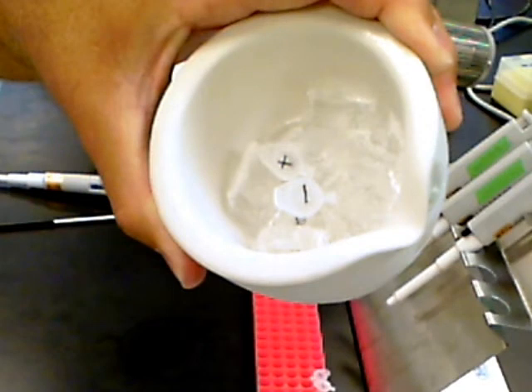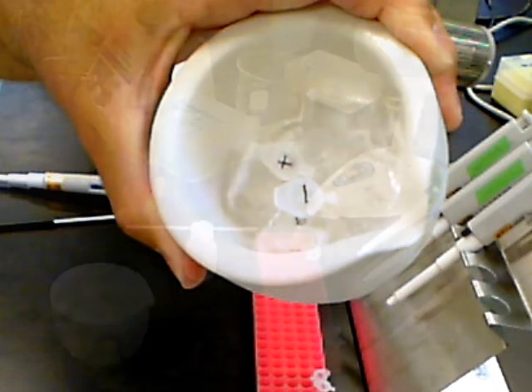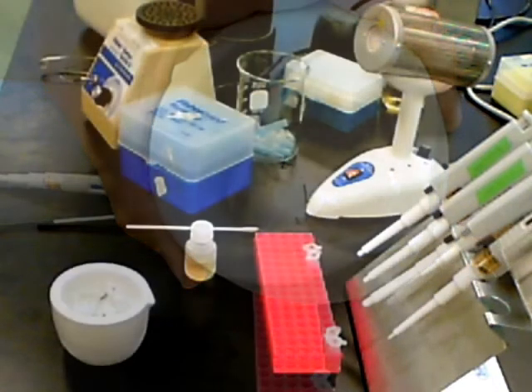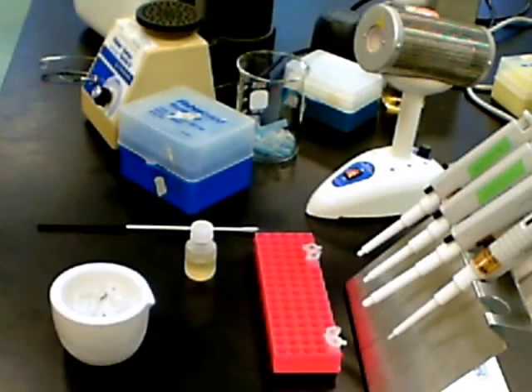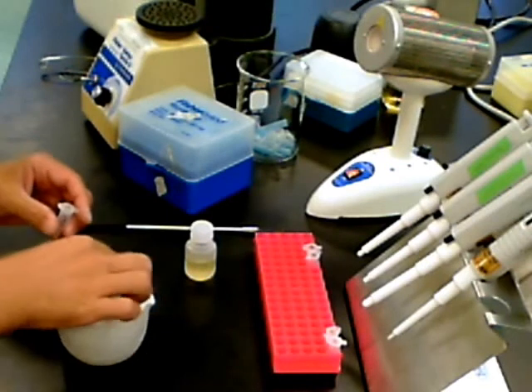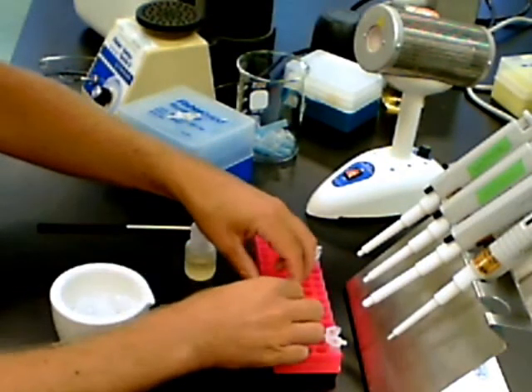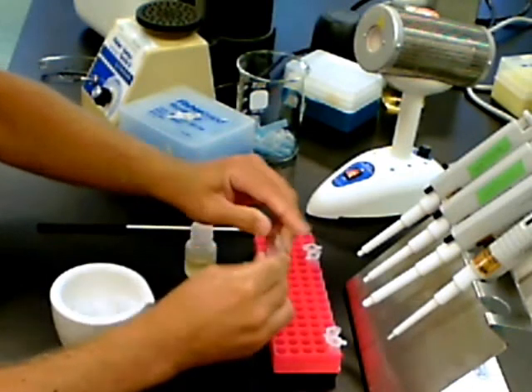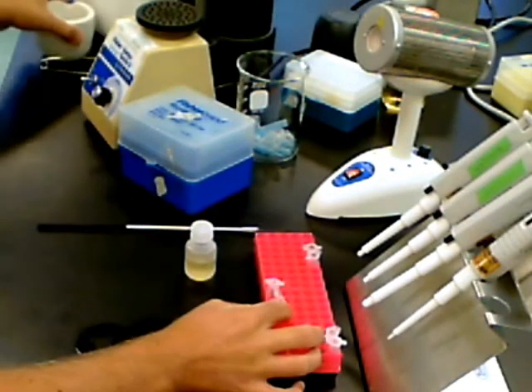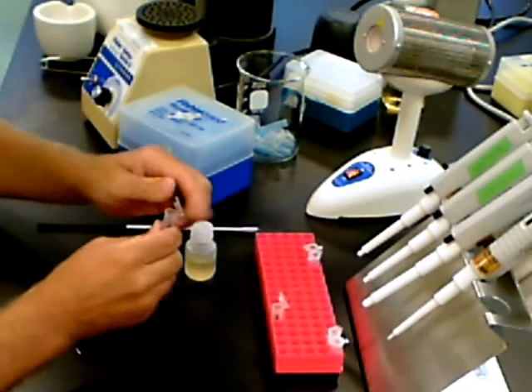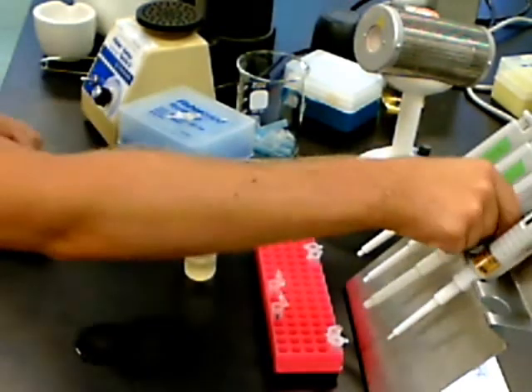Afterwards, we're going to return both tubes to the ice and incubate them for an additional two minutes. And then using a sterile pipette, we're going to add 250 microliters of recovery medium to each tube and mix them well.